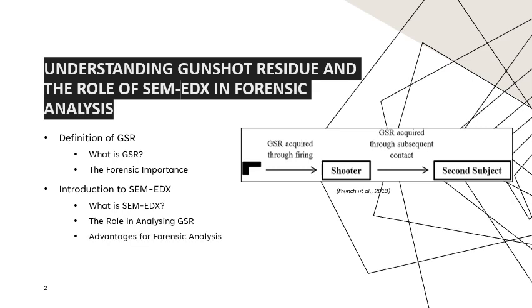The advantages for forensic analysis. The technique's high resolution enables the detection and analysis of very small particles, which is crucial for accurate GSR analysis. This capability is essential for forensic investigations where detailed evidence collection is paramount.